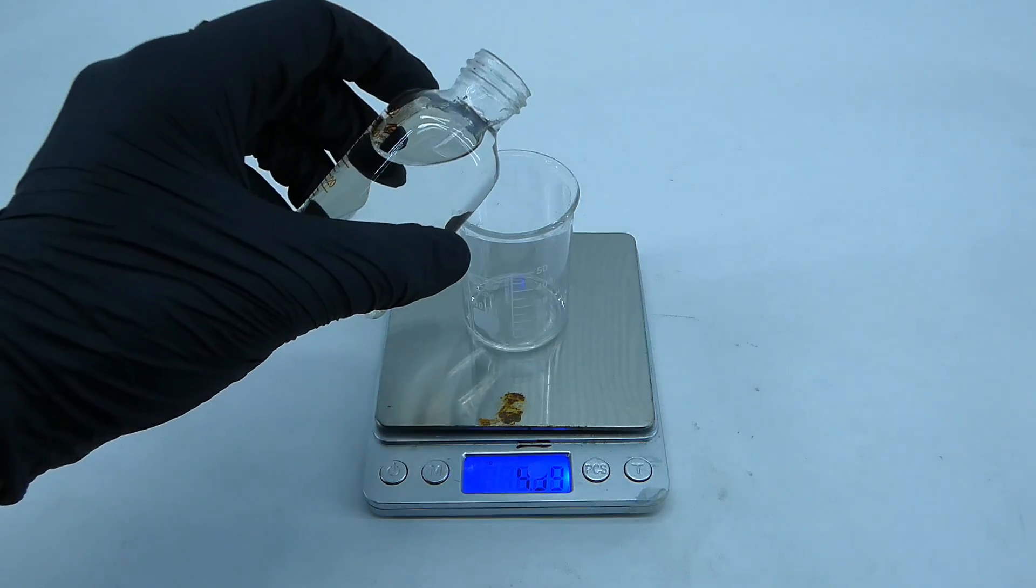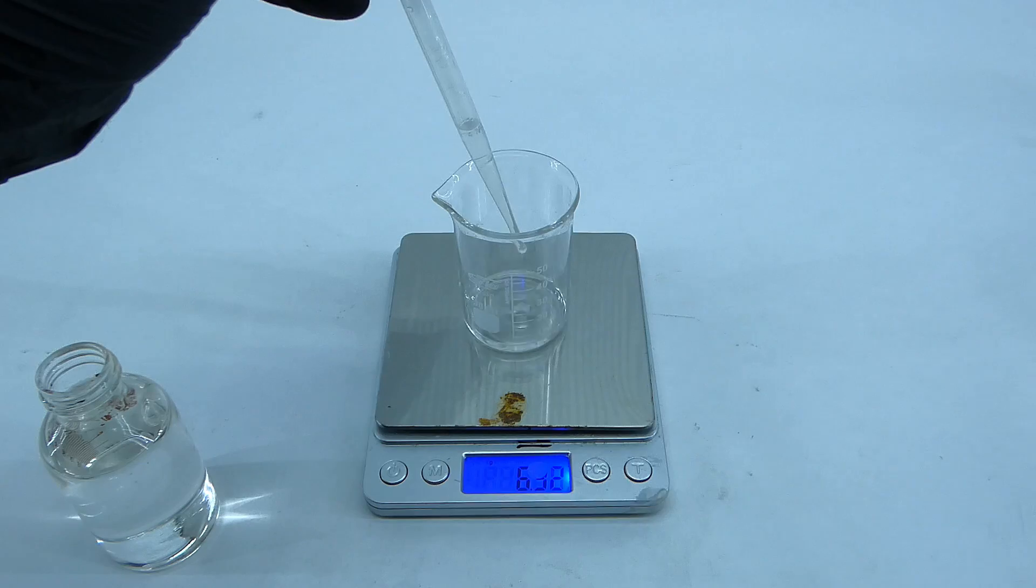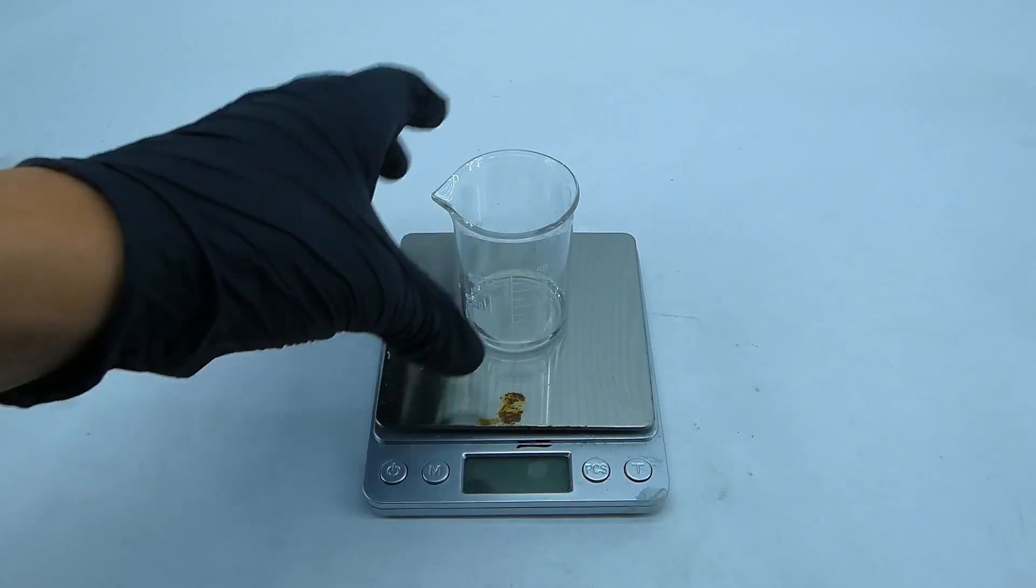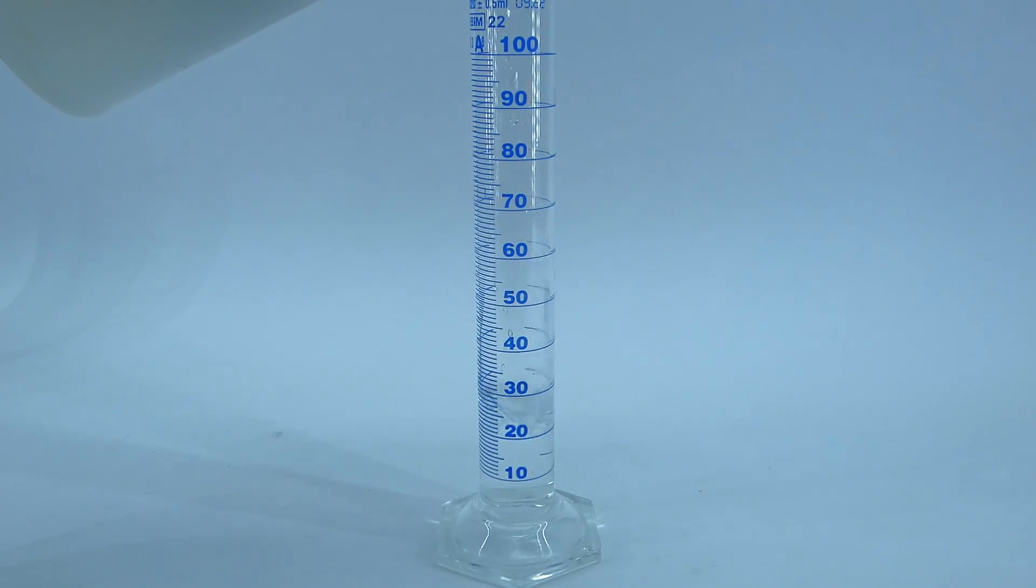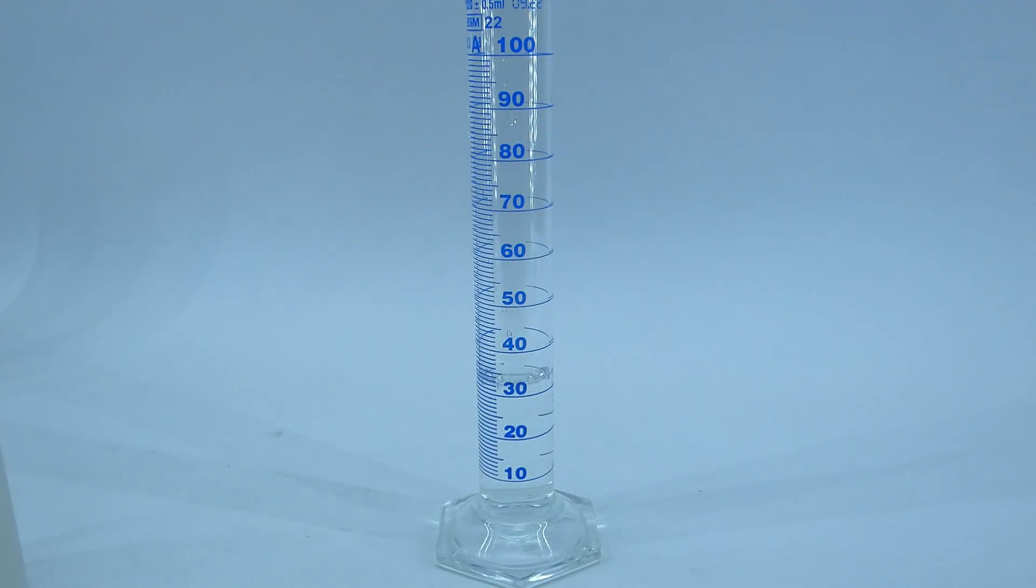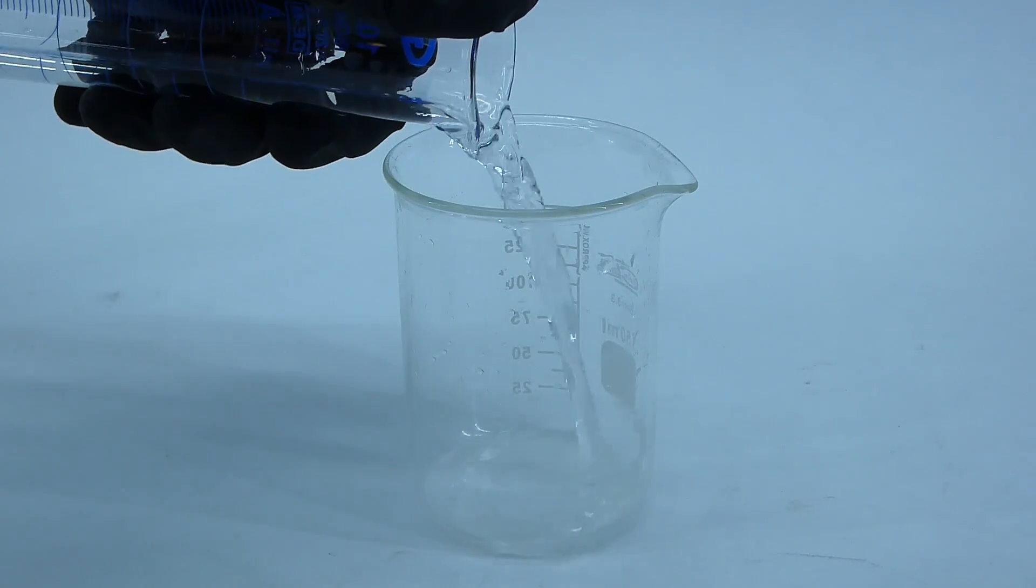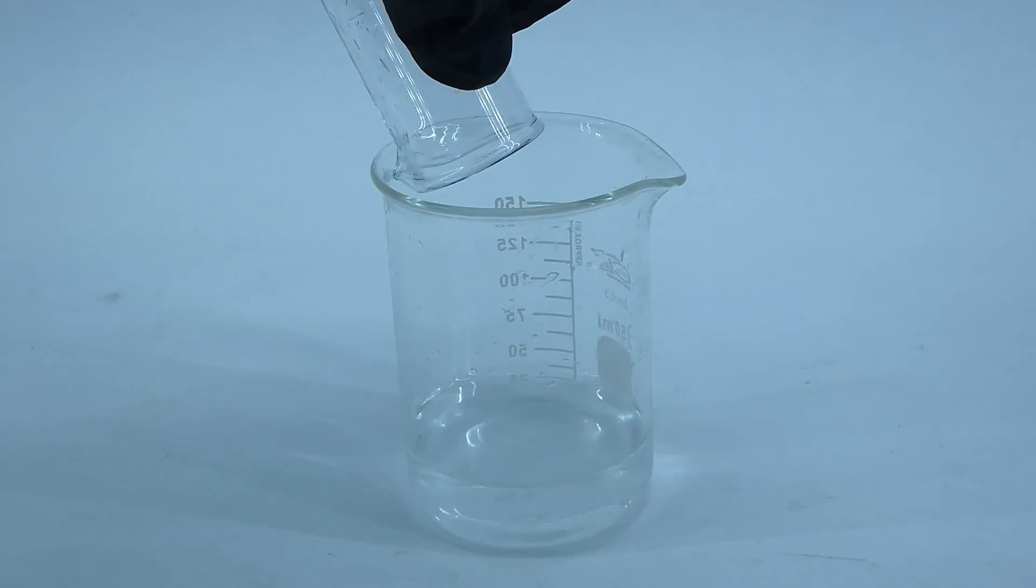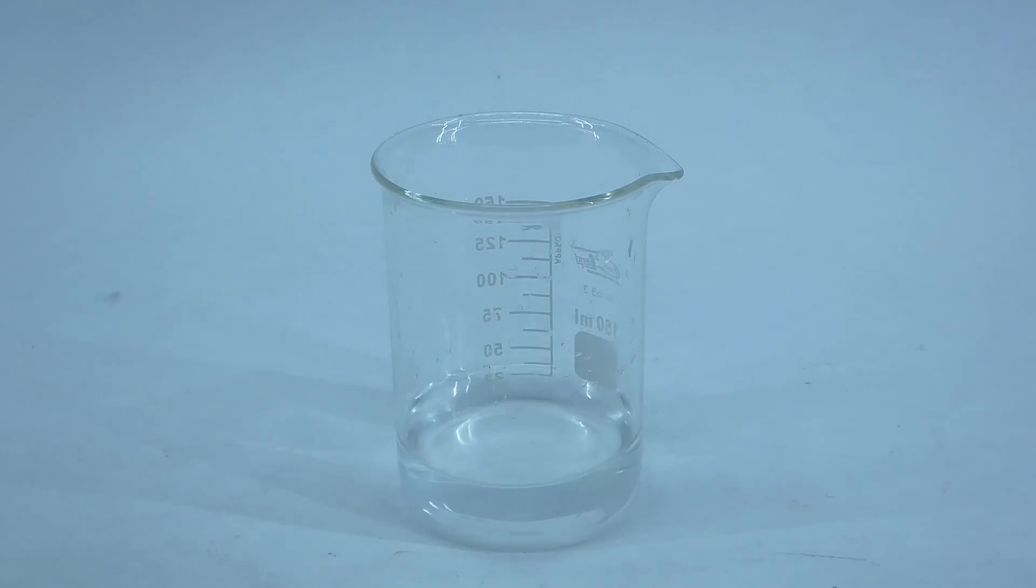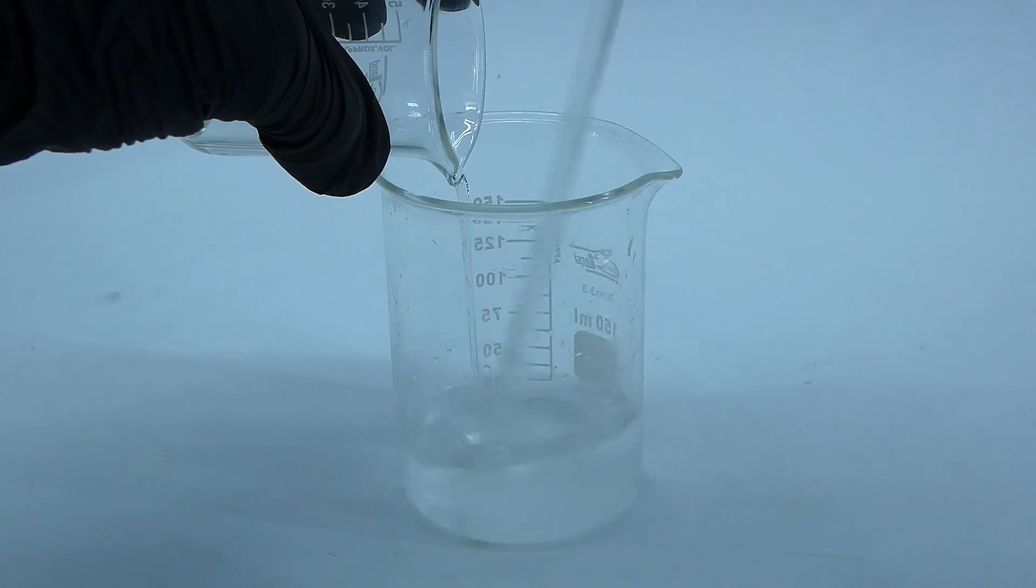Anyway, I weighed out 7.5 grams of 96% sulfuric acid, and after that was done, I measured out around 37 ml of distilled water. Now it was time to add it into the sulfuric acid. I could add the water into the sulfuric acid directly, but I wanted to avoid the risk of boiling the acid and people yelling at me in the comments, so I poured the water into a larger beaker, and then, under strong stirring, I slowly added the sulfuric acid.